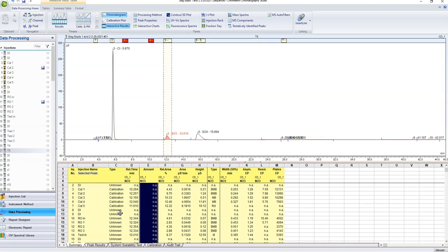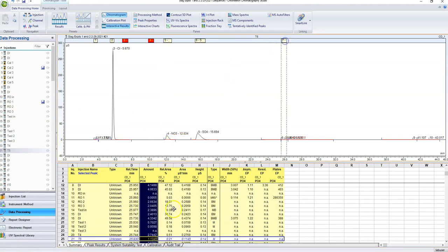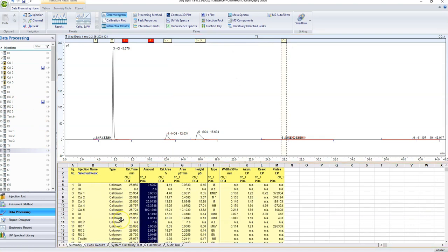So yeah, once you've done that, you've got all of your samples and all of your data in Excel, and you are ready to go. So that's basically how you do everything in a really basic manner. But there are a ton of different ways that we can analyze our samples with this process. And like I said earlier, the easiest way is to practice and play around with it.